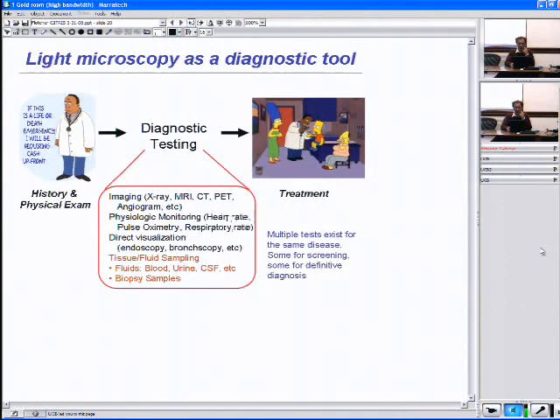And so the challenge that we face in developing countries and even in rural parts of this country is how do we bring those two together? If we want to do this sort of diagnostic testing with light microscopy, must it always be done at a hospital? Must it always be done 20 feet from a clinician? Or can we try and separate those steps of data collection and data analysis?